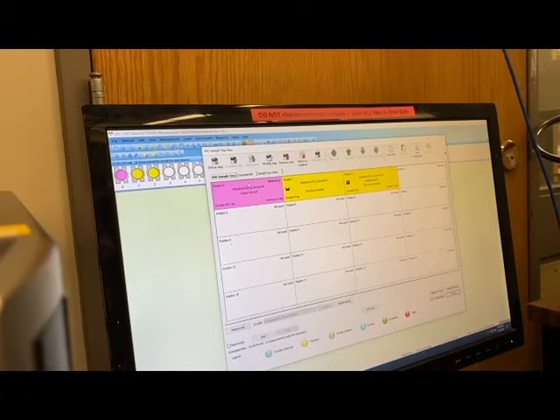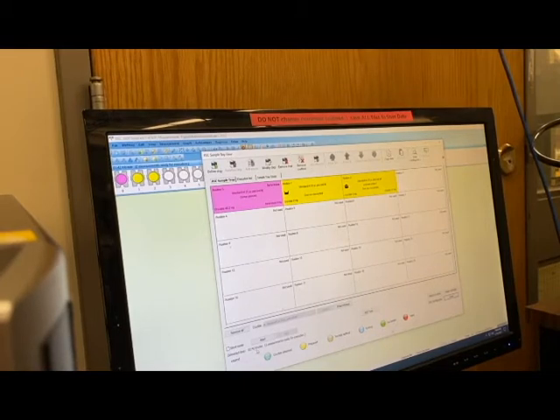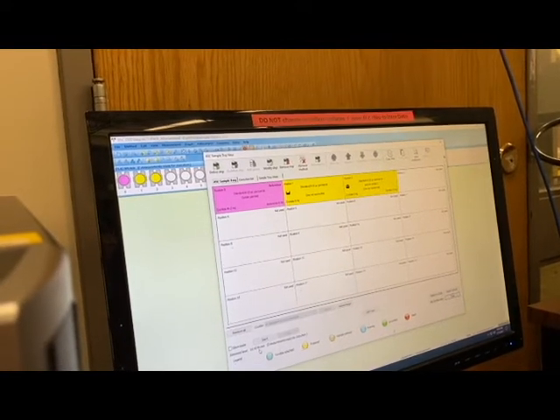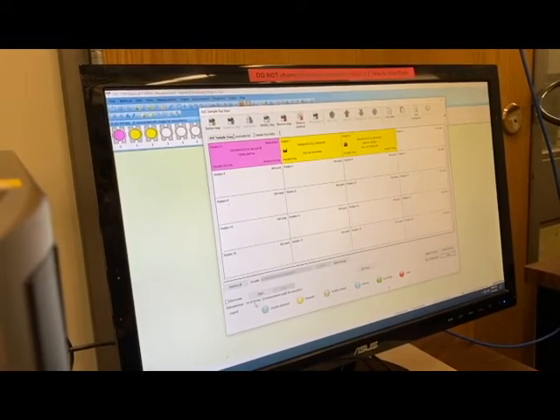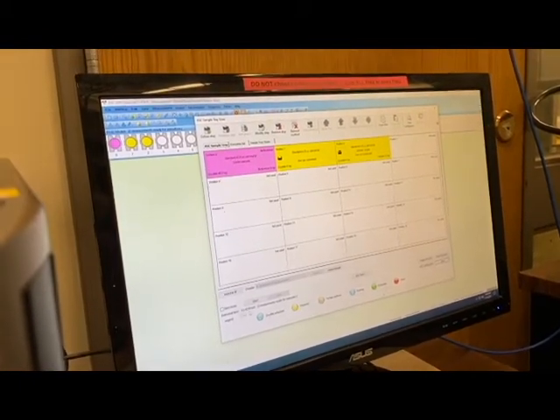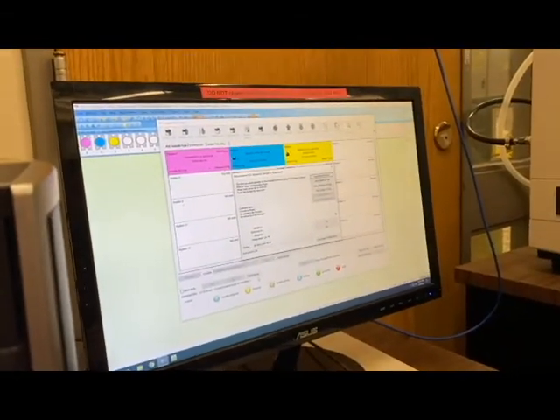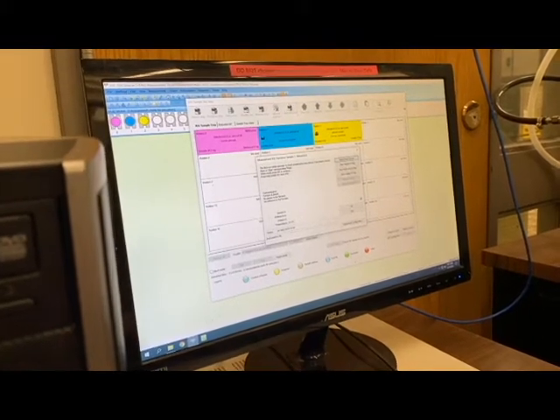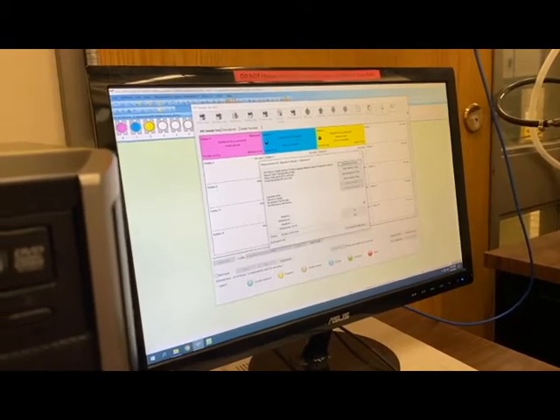You can do as many runs on as many locations as you want, all the way up to position 19. At the end, it will give you an estimated length of time for the entire cart to run — not the exact time, since there are two to three minutes of equilibration time between each crucible. My one correction and one sample will take about one hour and 42 minutes, plus five minutes or so. Once you hit Start, it gives you one last dialog box to check that what it believes is true: the furnace is closed, there's no sample in the furnace, and no reference in the furnace.